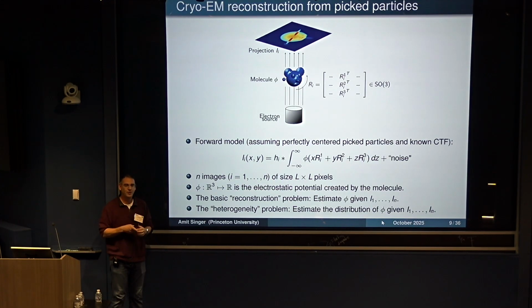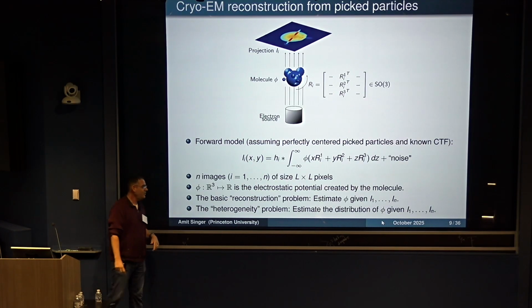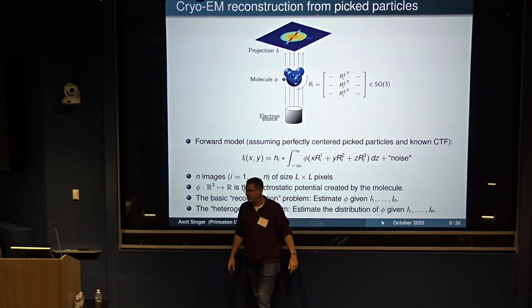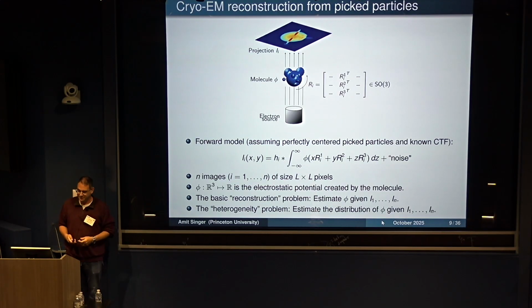Let's say I'm the molecule, okay? I can flex my arm, twist my head, and do all kinds of different things. And so I can appear in different shapes, actually, different deformations. And then you want to estimate not just a single 3D structure, but actually the entire distribution of possible structures and the density.